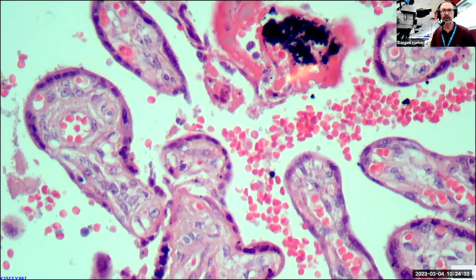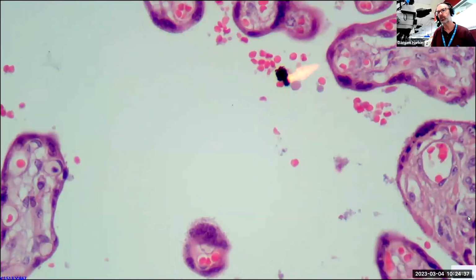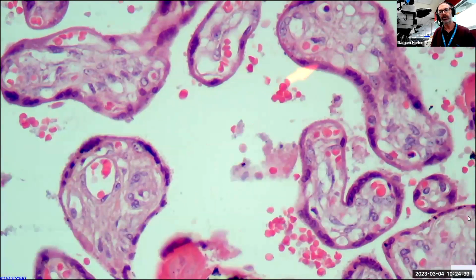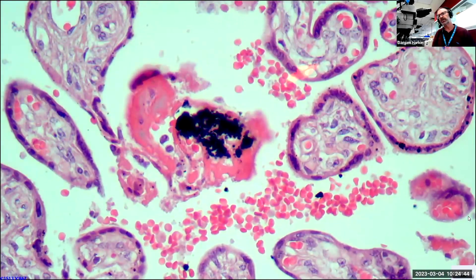So this is obviously not a case of being sloppy with how the formaldehyde has been prepared or stored or used, but there could be situations where the acidity of the tissue itself is such that it's promoting this reaction when the formaldehyde then is introduced, okay? So however it's been formed, how do we get rid of it?